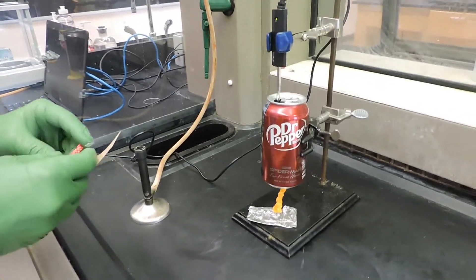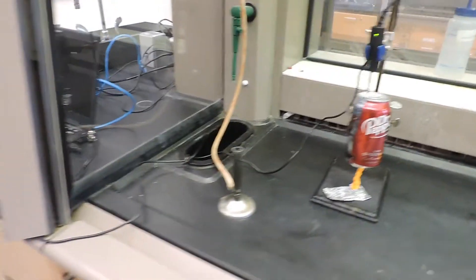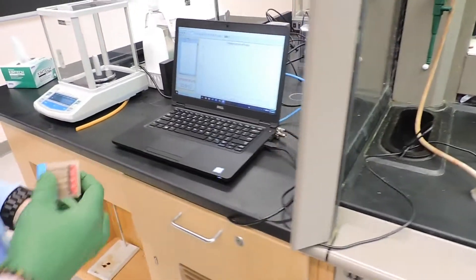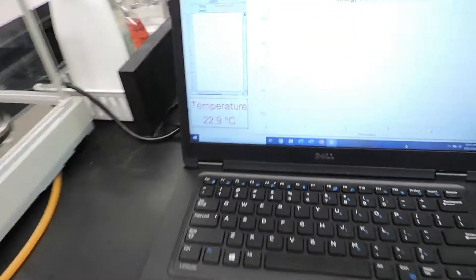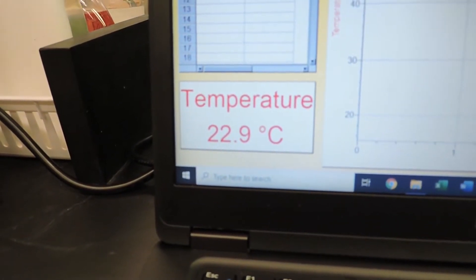Using the temperature probe and the Logger Pro software, we can record the initial temperature of the water inside the can, which is 22.9 degrees Celsius.